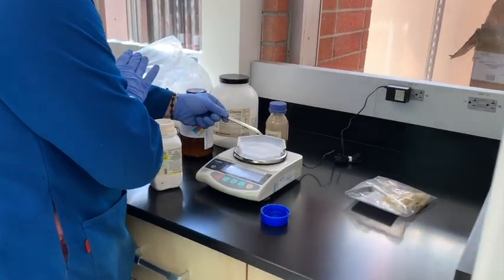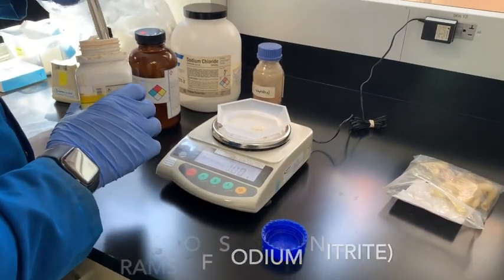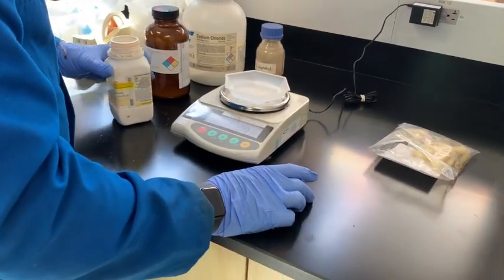It's kind of chunky. Hopefully we won't get too much. Definitely don't want to spill this stuff. It can be pretty nasty. Well, if it's a little bit more, then that's fine. Just make note of it in your lab notebook. So we were aiming for 0.95 grams of this sodium nitrite, and now we have about 1 gram.